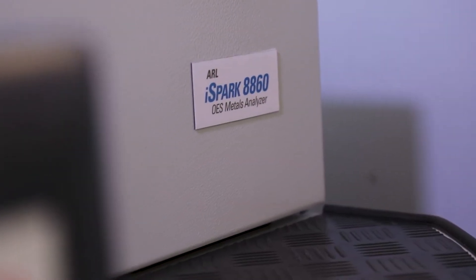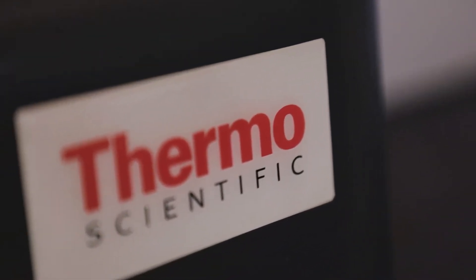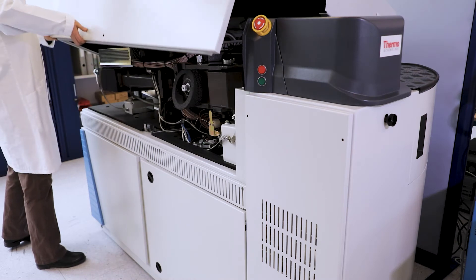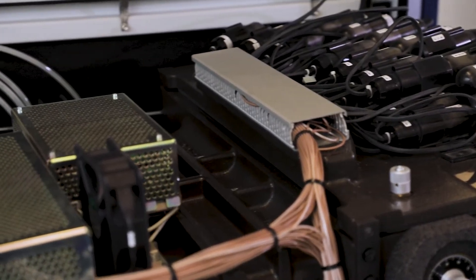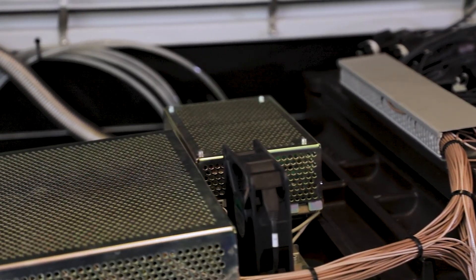The ARL iSpark is a high-performance OES spectrometer platform based on the best photomultiplier tube optics. It features a revolutionary digital spark generator and advanced signal acquisition and processing algorithms for the most advanced OES analysis.